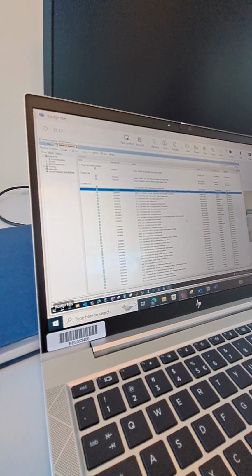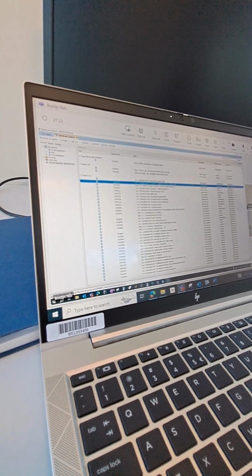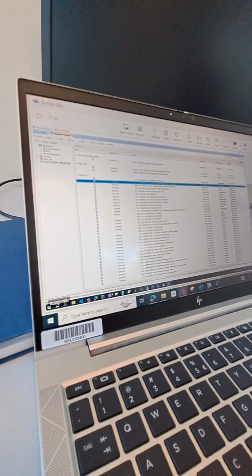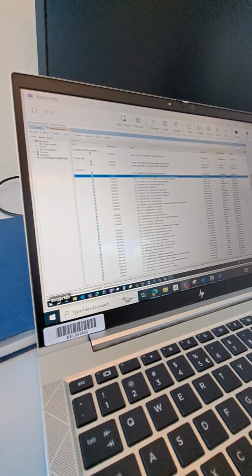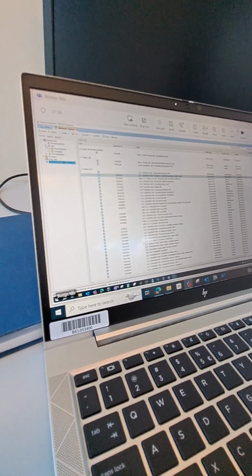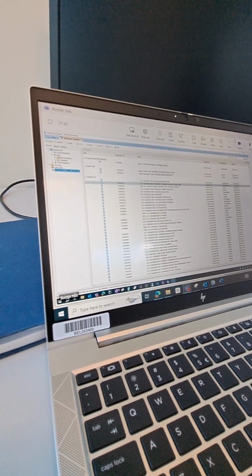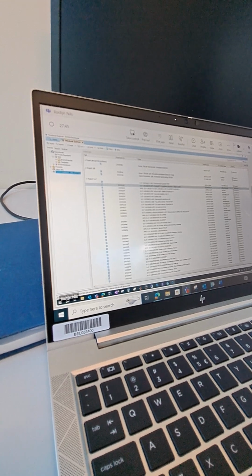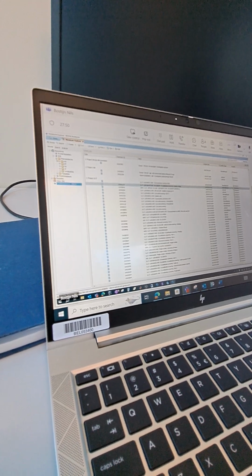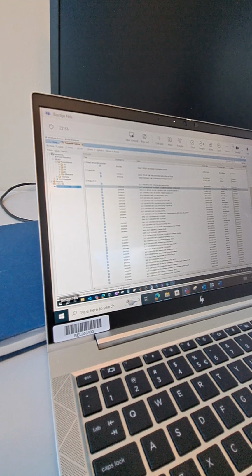Okay. And then I think I just need to show you how to look in the ELNs of other people. So here in repositories, you can go to NCE and expand it. NCE stands for new chemical entity. It's a denotation here for small molecules, because we also work on biologicals. Pharma science is our department, so you enlarge it. Then you will see the AD, DP, DS, and IT.